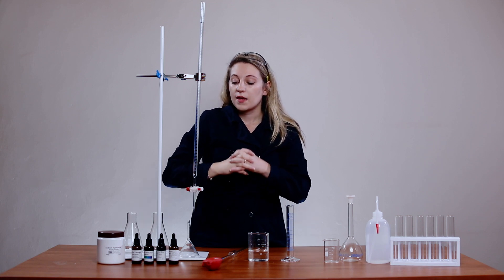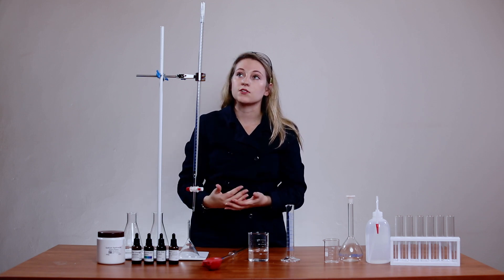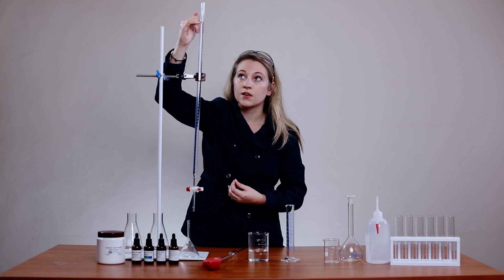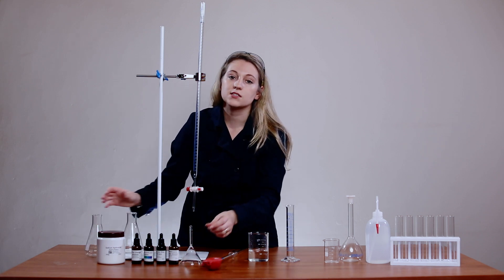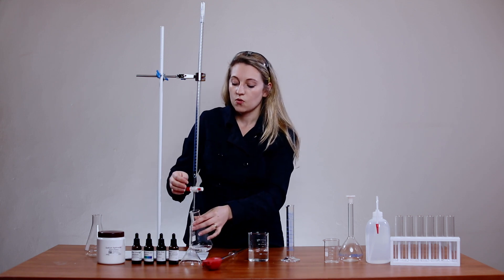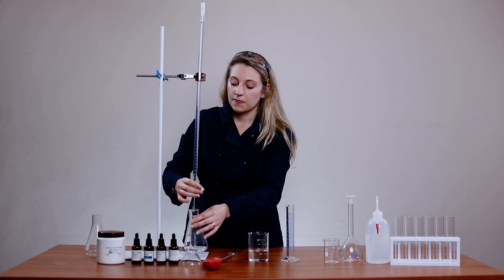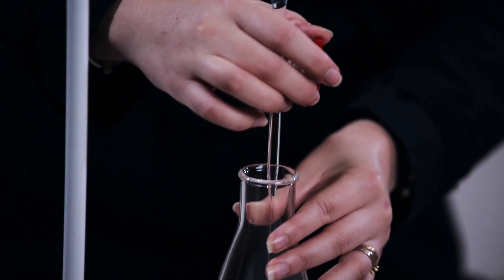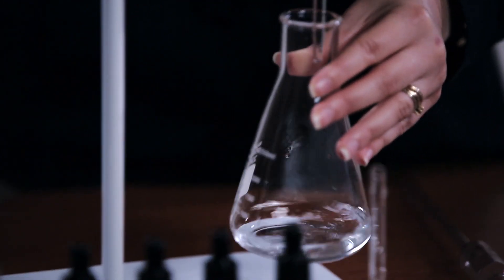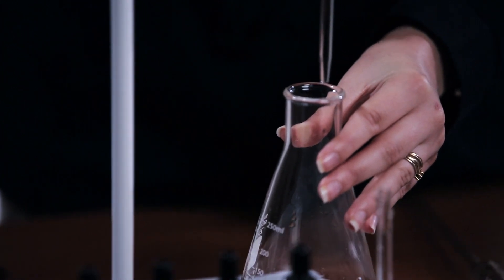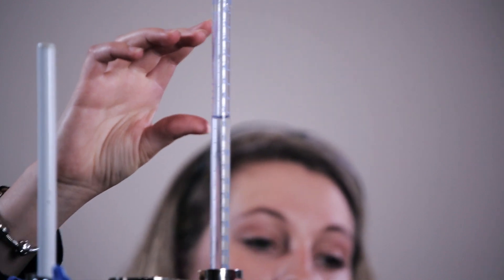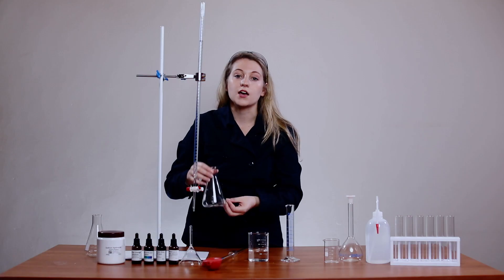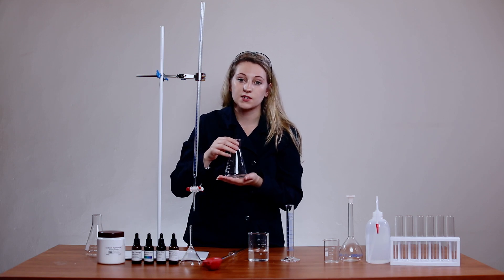What's important when you actually perform your titration is to record the initial value and the final volume. When you perform your titration you open the tap, your liquid goes in, and then you'll observe a color change because this is for an acid-base titration. The change in color is when you know that's your end volume. The change in volume is going to be the volume that you require to neutralize the base that was inside of your Erlenmeyer flask.